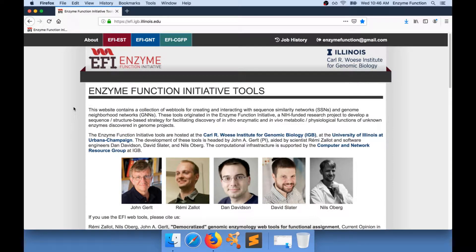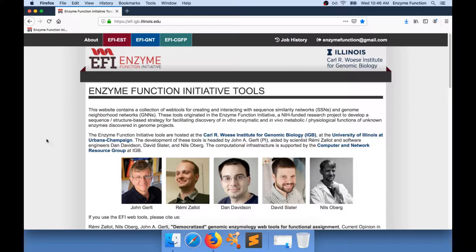The Enzyme Function Initiative website contains a collection of web tools for creating and interacting with sequence similarity networks and genome neighborhood networks.